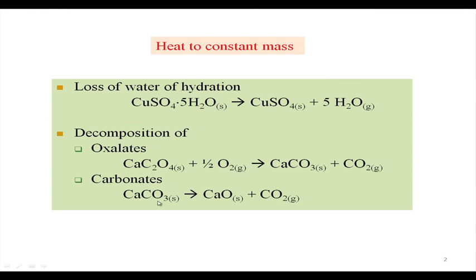Similarly, while heating this particular one, in the second step we do not need any oxygen for the decomposition, it goes out directly. So, calcium carbonate will be degraded into calcium oxide. We know the use of calcium oxide, that when it traps water, we get slaked lime and so on. So, this also can give rise to carbon dioxide from the sample.